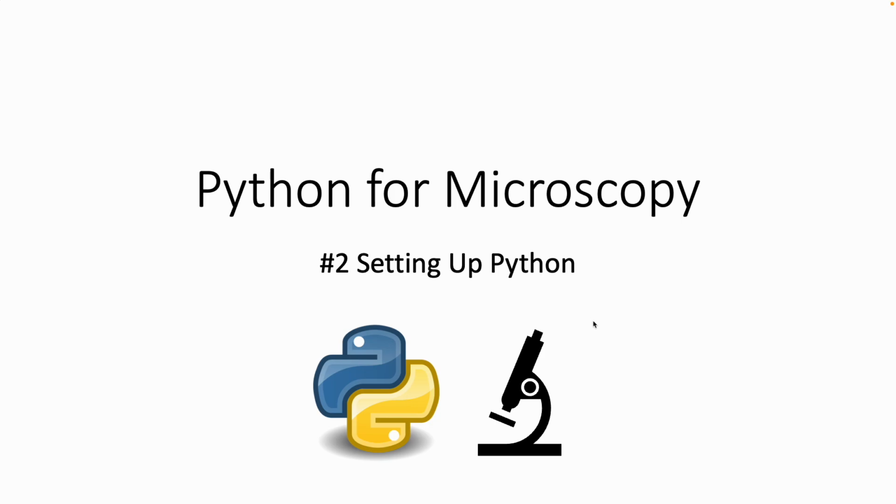Everyone, and welcome to the second video of the Python for Microscopy course. Today it's about setting up Python on your computer.